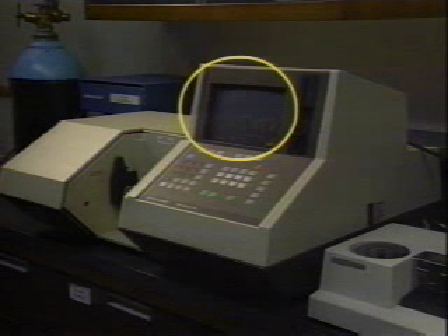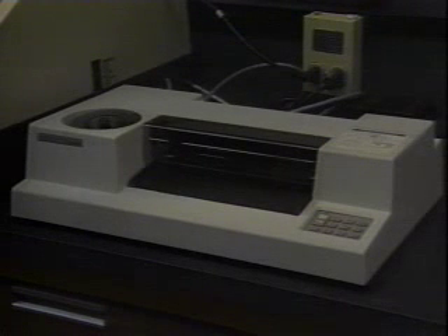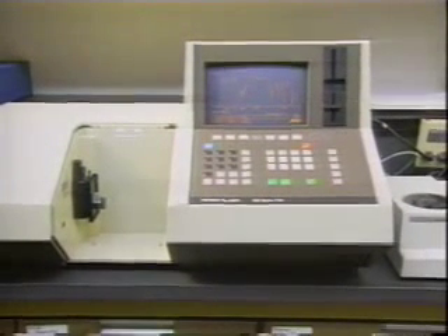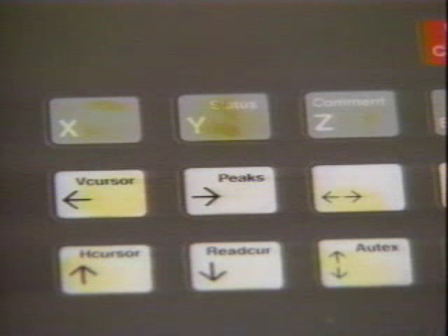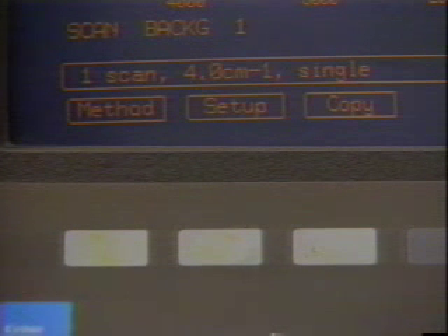This is the screen, the sample holder, the touch pad, and the plotter. First, place your sample in the sample holder. The keys you will use most are plot, scan, X, Y, Z, and the seven soft keys along the top. The function of each of the seven soft keys changes as the FTIR carries out various processes. The function that a soft key will perform at any one time is indicated by the soft key label in the box directly above it on the screen.